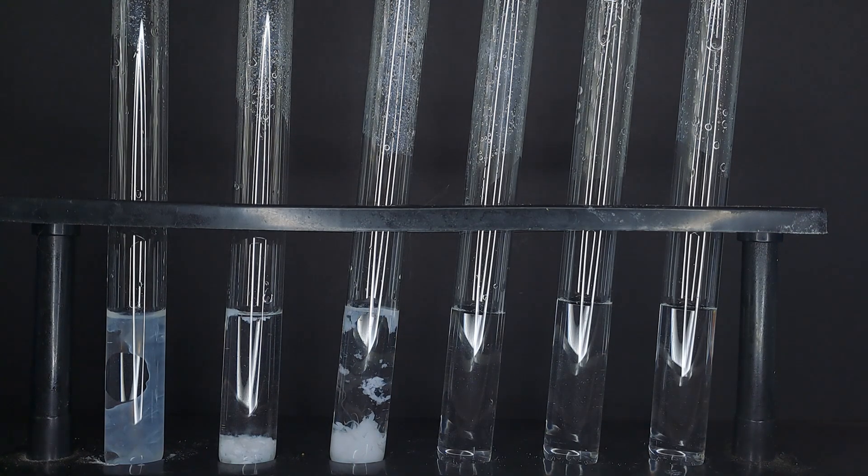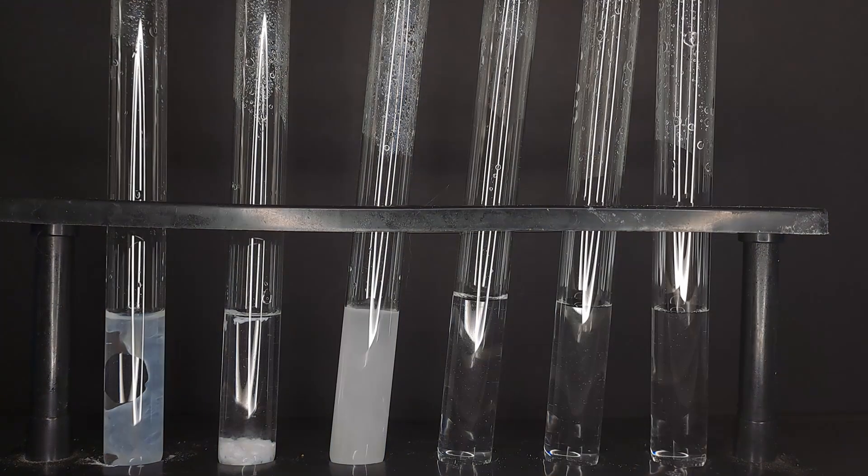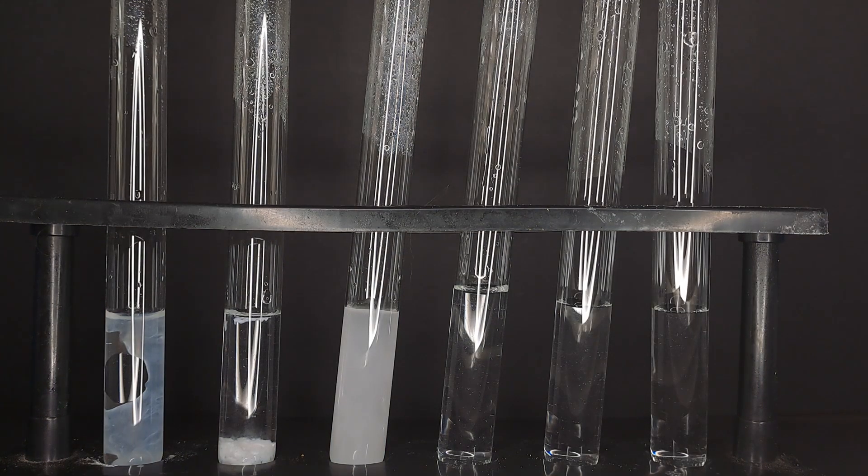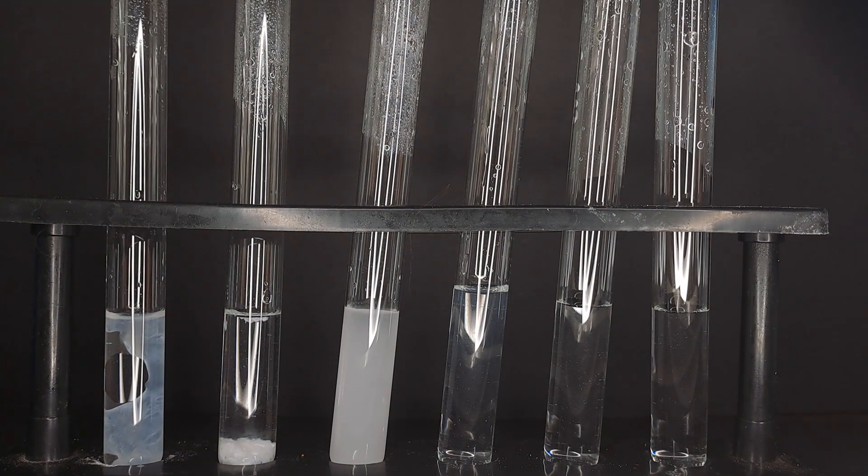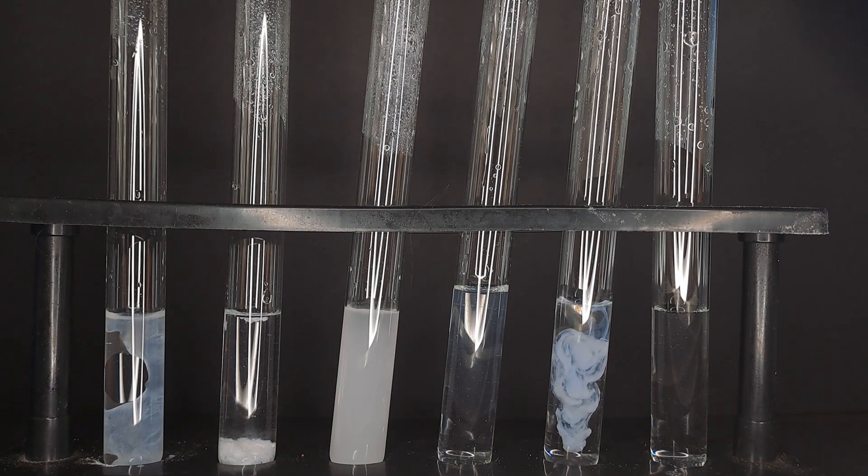In the fourth test tube we add 0.1 molar sulfuric acid and then 3% hydrogen peroxide. Initially nothing happens but keep your eyes on the test tube as we proceed.